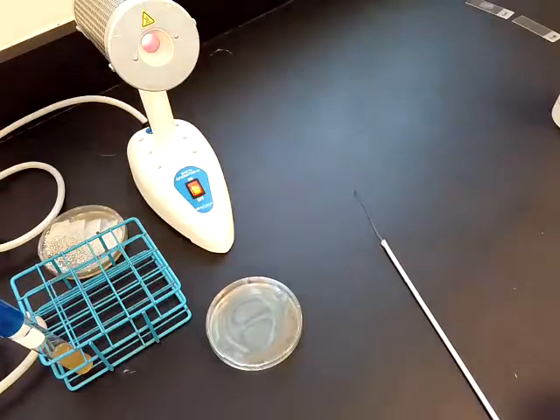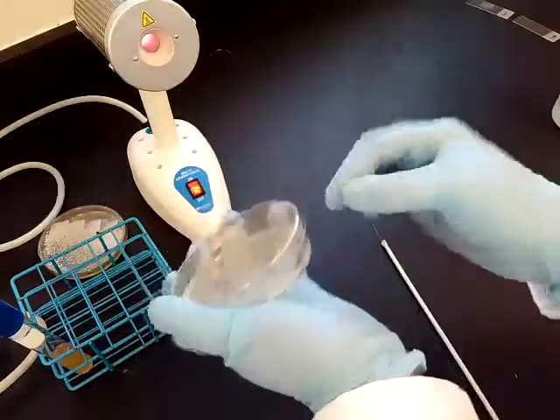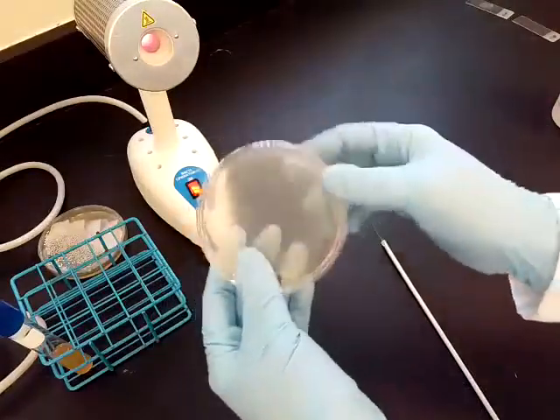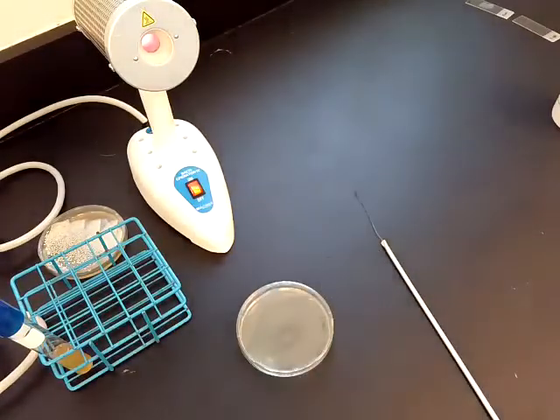Sometimes I'll look into a clinical lab and I'll see people holding the plate up like this and going in there like that. Not only are you contaminating it with your breath at that point, but you're risking dropping it on the countertop. So it's best to leave it on the counter when you're performing your streak plate method.